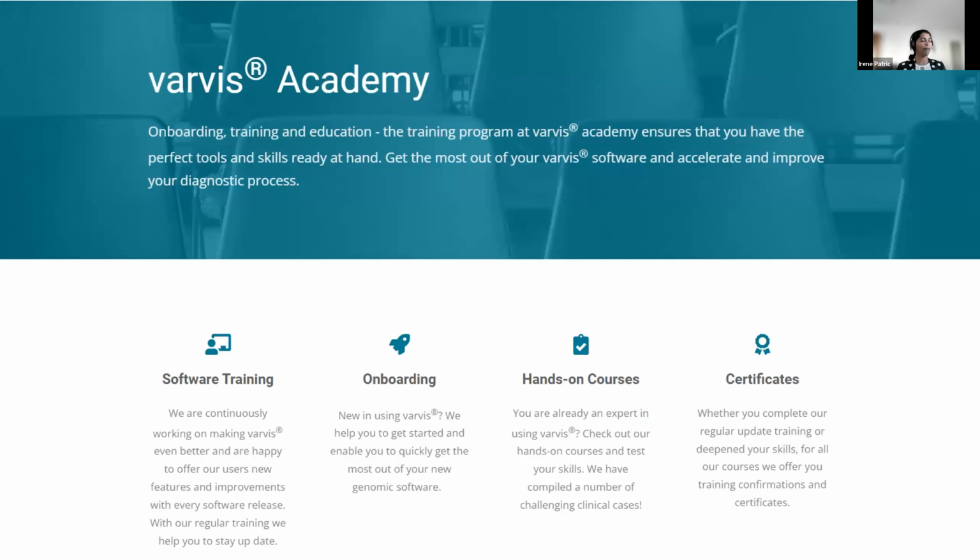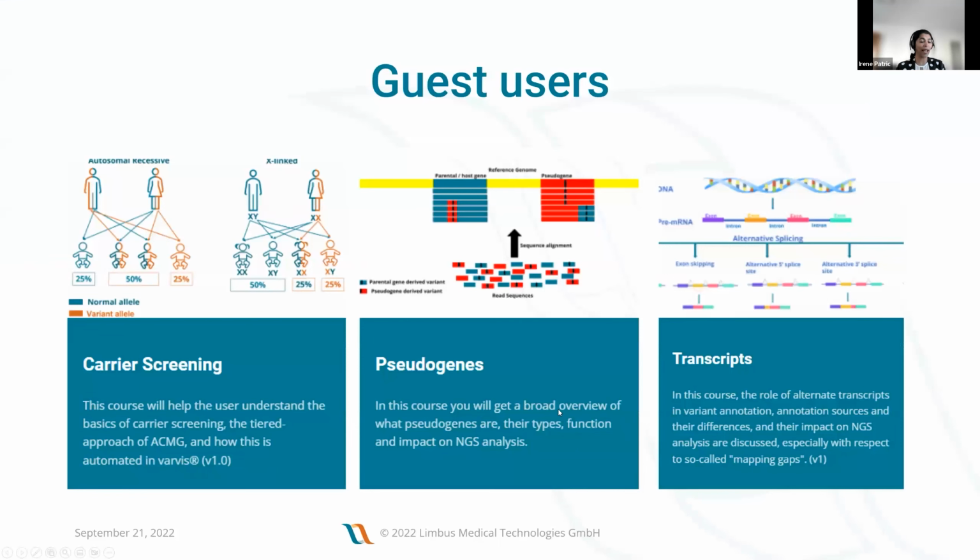Now, varvis Academy, which I mentioned earlier, is the training platform where everybody, from new users to existing users, is able to benefit by revisiting the material that we have there. We have courses for guest users, like the one that I mentioned, the transcripts, but we also have a course for carrier screening, for example.